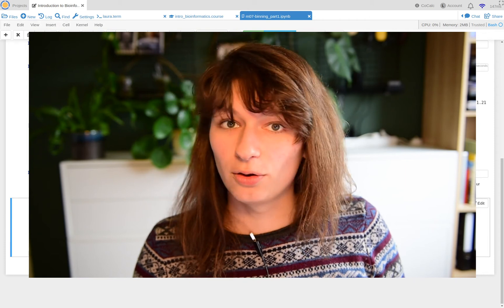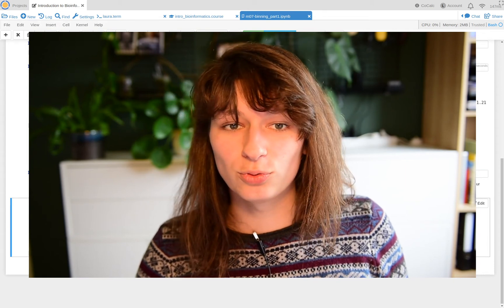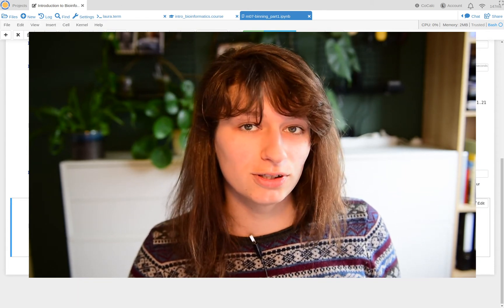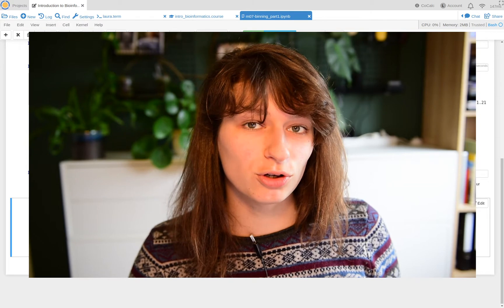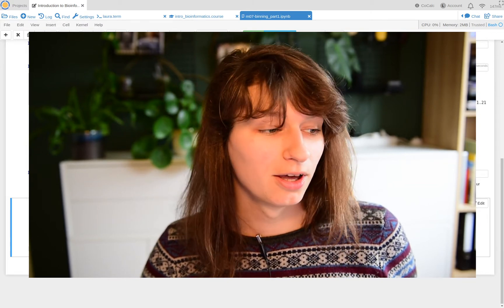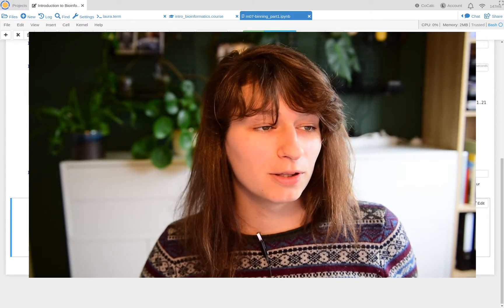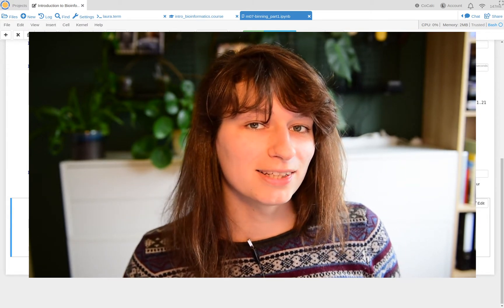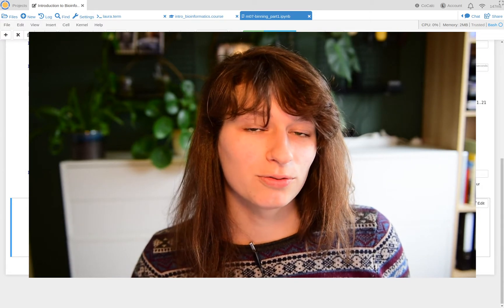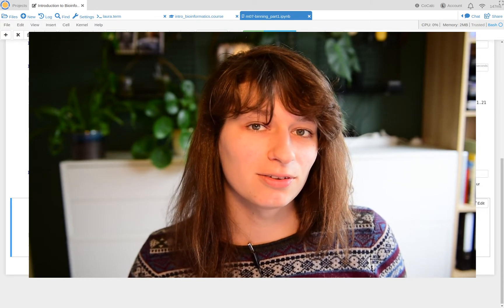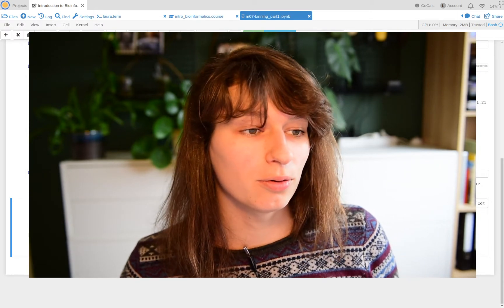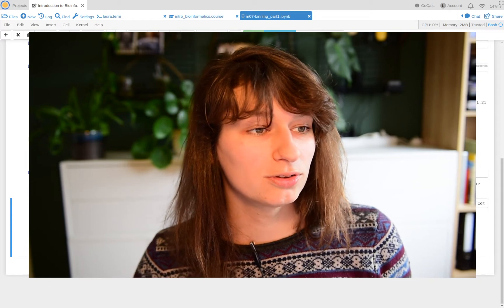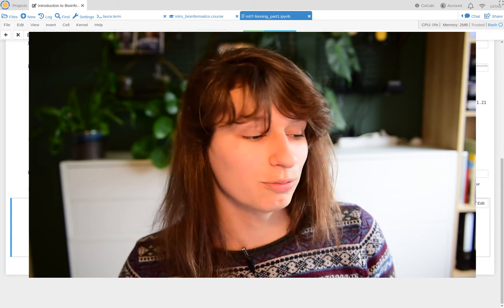Hi all and welcome to another video for the Utrecht University course Introduction to Bioinformatics. In this video I'm going to go through the Excel assignment that you can find inside the Jupyter Notebook — M07 Binning Part 1.